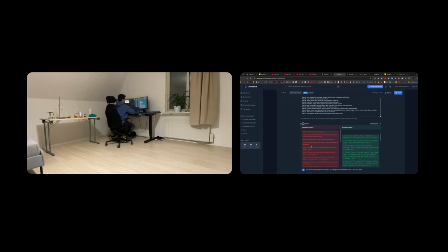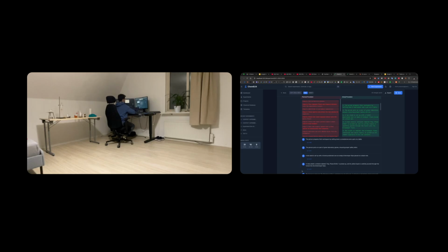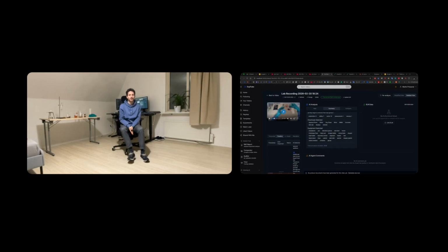And this is being implemented into the ELN, connected to the ELN directly, and we have full transparency on what is happening in this experiment. You can watch a procedure summary, see what chemicals we have used along the way, what equipment we have used, and link it to the ELN. So yeah, this is basically it.